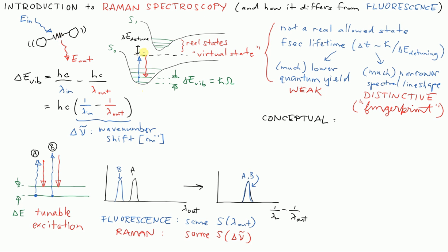It kind of makes sense on the energy level, but it's nice to have some concept of what's going on. And here's what I would say about that. Suppose you start off with your molecule again, your little 2-atom molecule, and it's going to have some electron charge distribution. I'll just write this as some sort of notional cloud surrounding this.